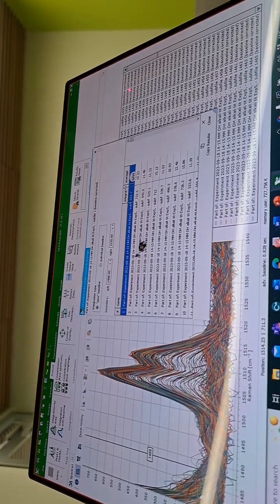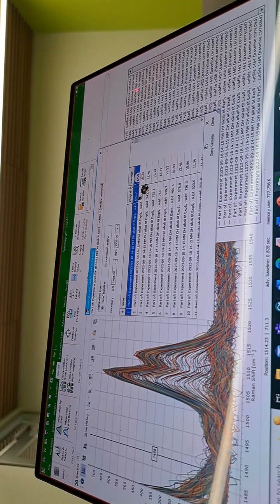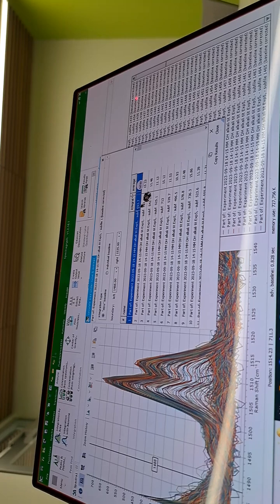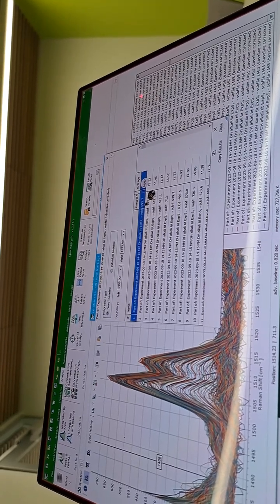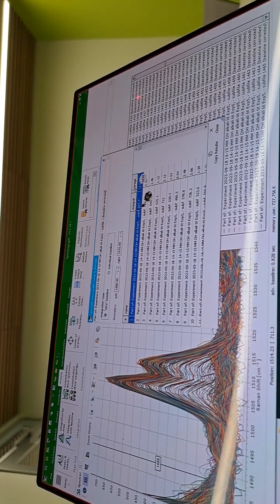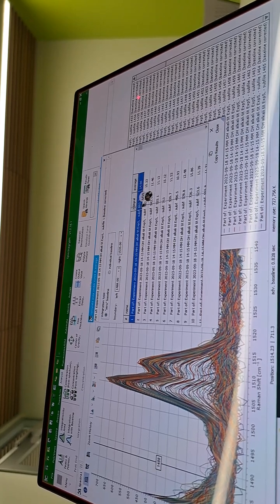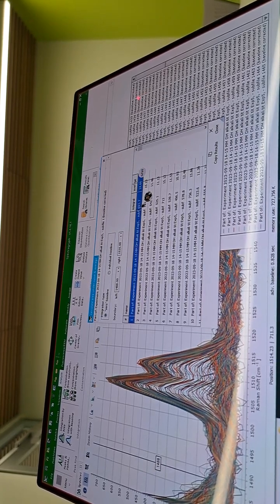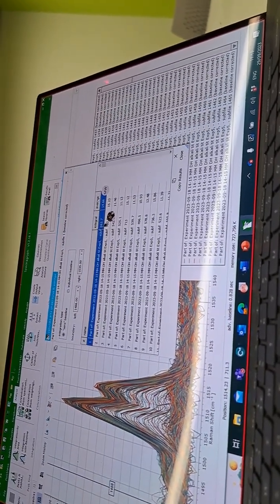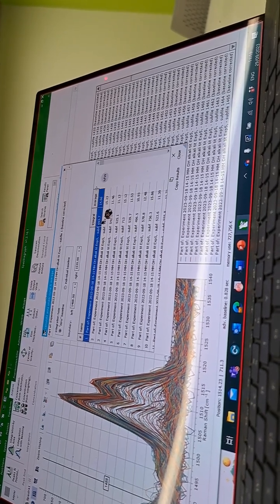But here, even from the start, the value should be negative. It is negative. No, I'm asking you why should it be negative? That makes no sense. Yes, yeah. I'm just saying because if in the start there is no myconazole, the value should be negative, and with the passage of time, as the peak is evolving, it gets higher and higher.